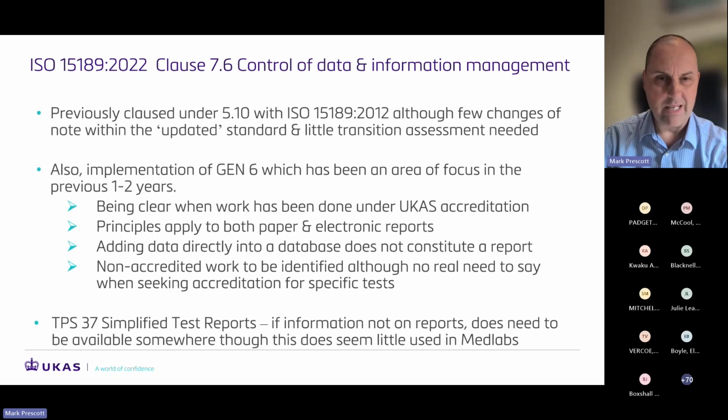Some laboratories within their user information do like to say that when they're seeking accreditation for tests, but there's not really a specific need to do that. I think some labs just like to do it because then it looks like they are seeking accreditation for it. I wouldn't be surprised if there's any questions on Gen 6 at the end, but it is an area that is still presenting some difficulty.